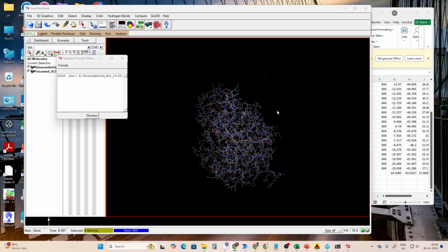After this, as in the previous step, should we be doing the RMSD calculation? Jara is saying yes. Any other?